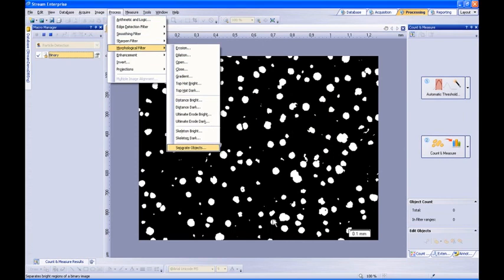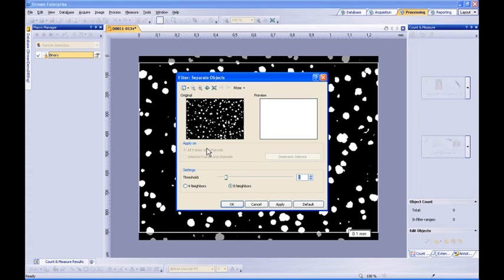You can execute this filter from the menu Process, Morphological Filter, Separate Objects. Modify the parameters of your particle separation filter, then click the OK button.